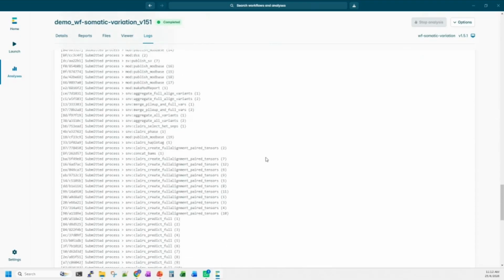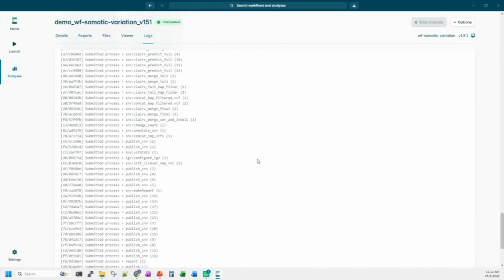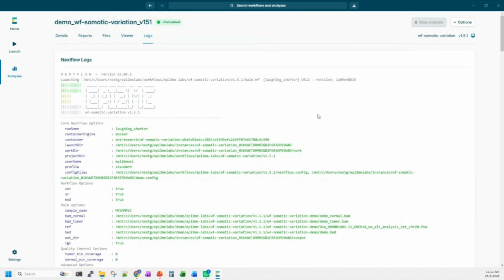We only look into this part when we do analysis and it runs into errors. So from here, we will try to see the error message, what could be the reasons that result in errors in our analysis, and then try to do some troubleshooting from here.